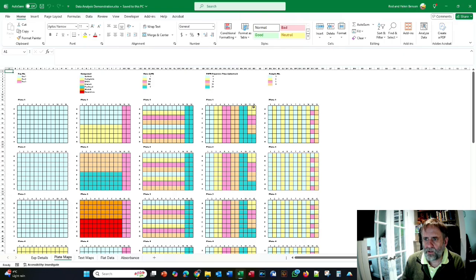There is a 0 dose control squashed in the side here. This is in quadruplicate. And then over here, we have the same time course. So this is the control here. We have the same time course over here, but now going from 0 to 30 minutes in increasing doses of a particular inhibitor, and the inhibitors are here. So some of these are EGFR inhibitors like gefitinib, and other ones are just straight cytotoxic compounds like carboplatin.